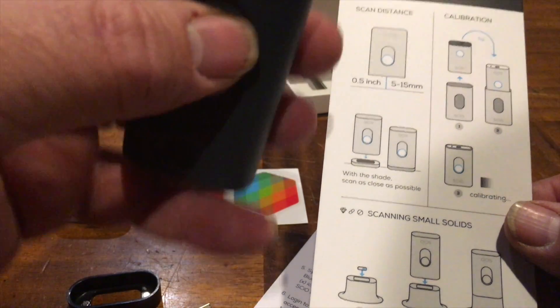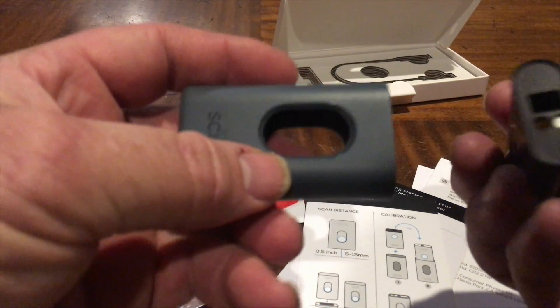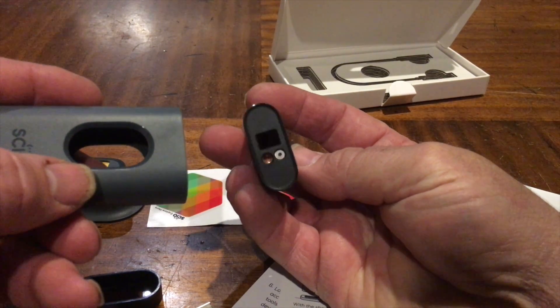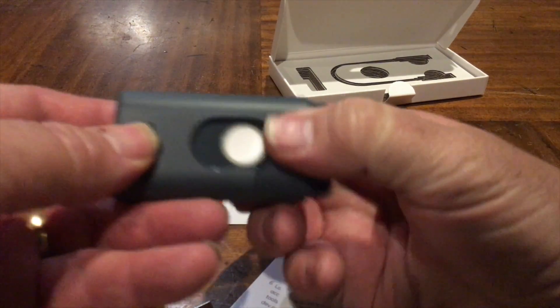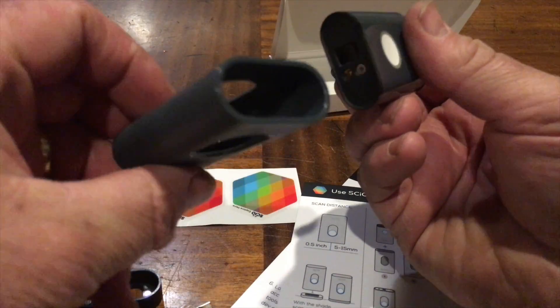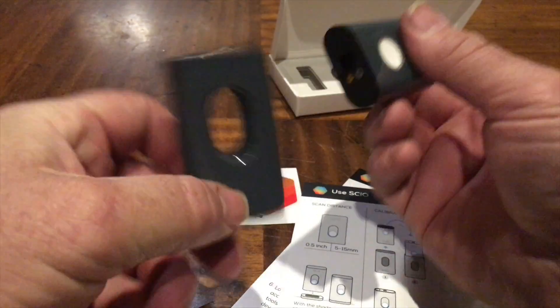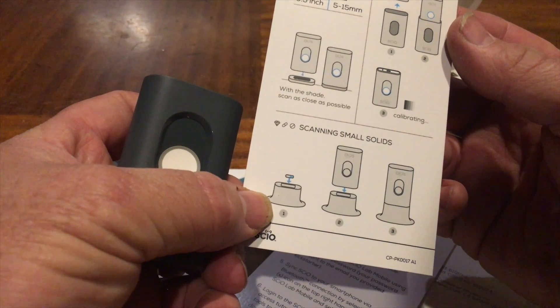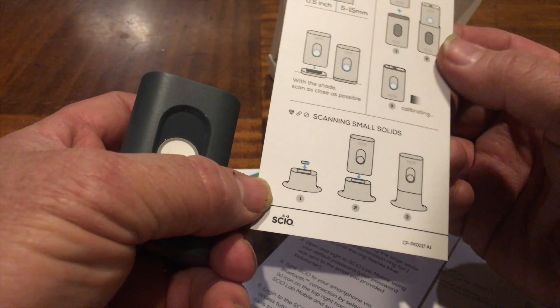Oh, does that come out of there? Yeah it does - there it is. So that's the actual sensor end - it goes in there and seems to suck back in, maybe with some kind of magnets. Back in there we see a white screen - I think that's what it's talking about for calibration. Flip it over - calibrating. And those little guys are for scanning.